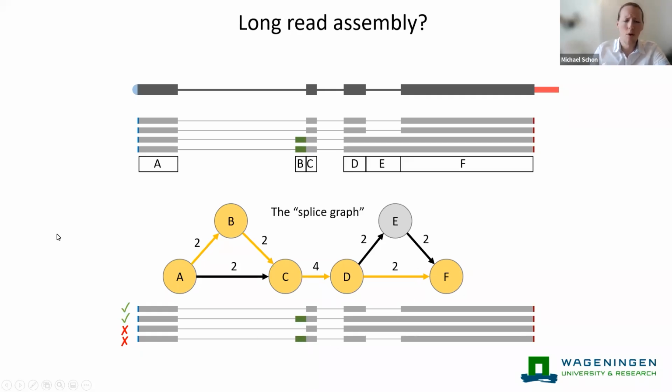molecules. And so there's a danger if you are incorporating long read data into your model that the information from different parts of the transcript sort of gets broken up. And I don't want to do that. I want to keep the full chain of information intact.